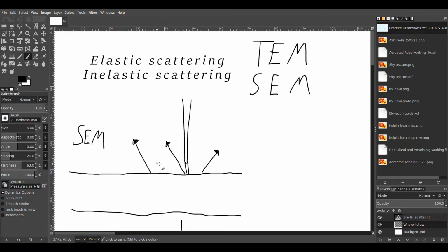So what can come back here? As you can see here, there are two main types of scattering: elastic scattering and inelastic scattering. The electrons here have some type of energy, usually called E0. This is like the start energy. With elastic scattering, what scatters back has more or less E0. They are allowed to lose up to 1 electron volt, but not really much more.